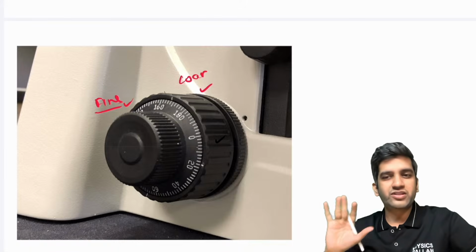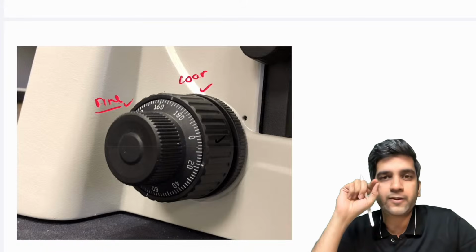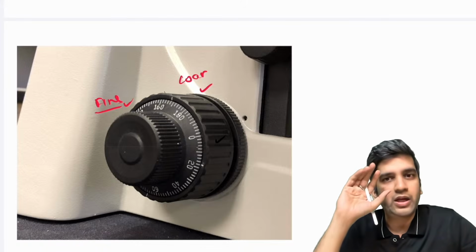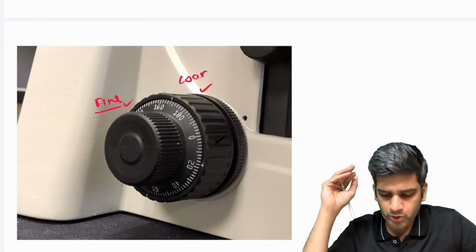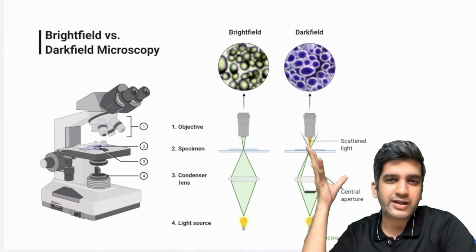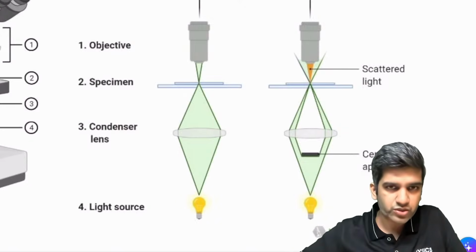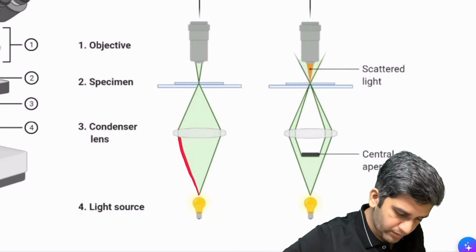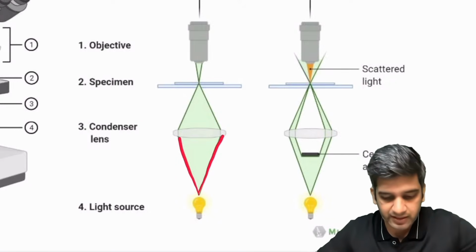Now this is about a simple normal microscope. What we are going to see in the next 3 slides are slight variations from a normal microscope. I'm not going to go into the electron microscopy thing. Simple slight variations from a normal microscope, fine? The first is Brightfield microscopy, which is a normal light microscopy, right? What normal light microscopy does is, there's a light source from below. It sprays the light through. We have the condenser lens. That's your iris diaphragm and the condenser, right?